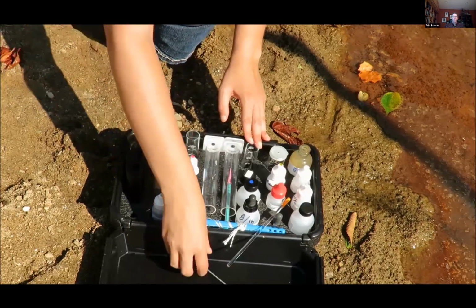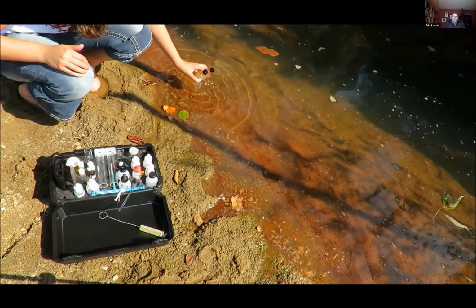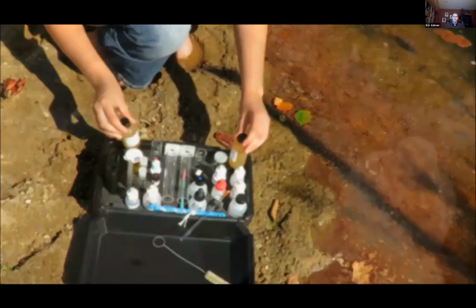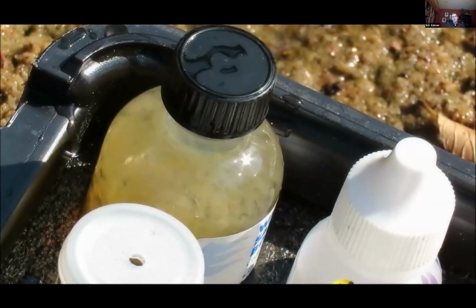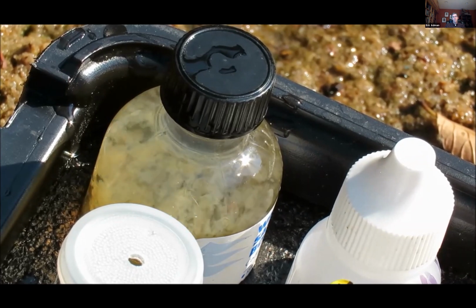Cap the bottles and rinse the outsides to remove traces of reagents that the bottles may have come in contact with. Mix the bottles by inverting at least 10 times. At this point, a tan, cloudy precipitate will form. Allow the precipitate to settle below the shoulder of the bottles. This may take a few minutes.